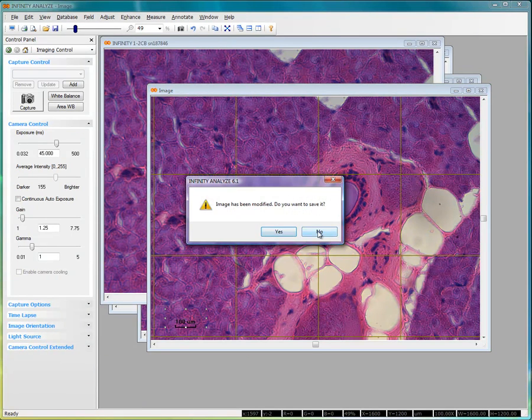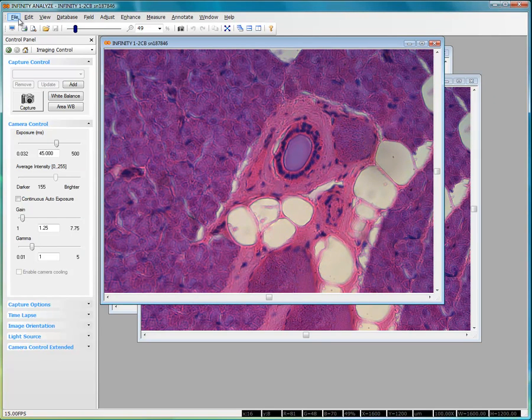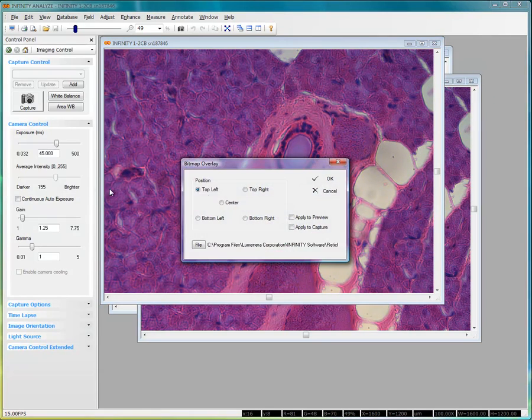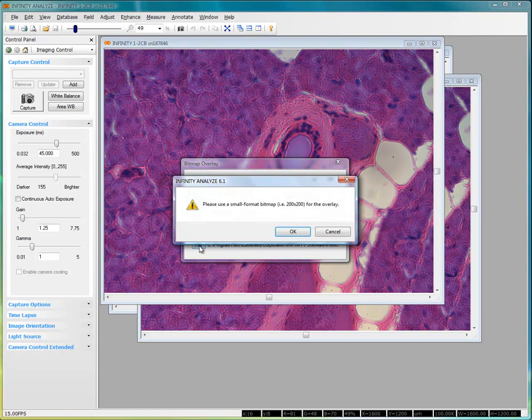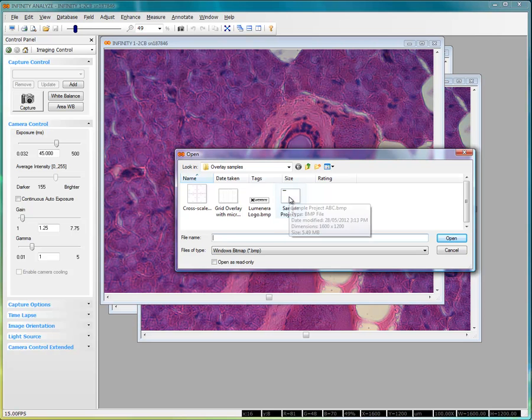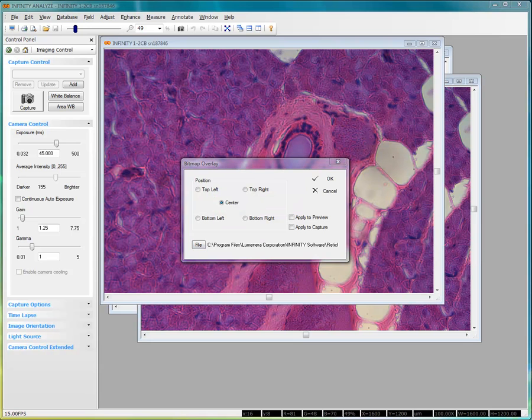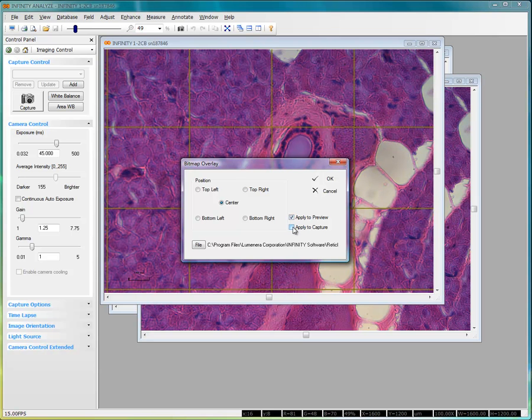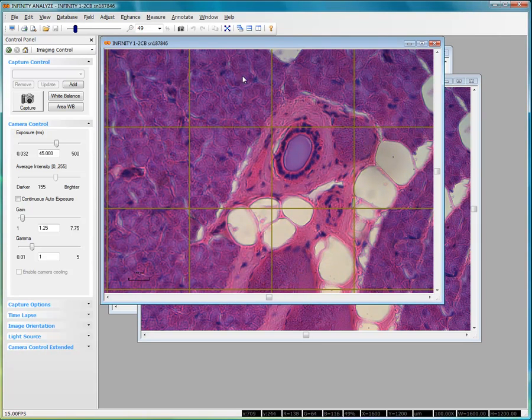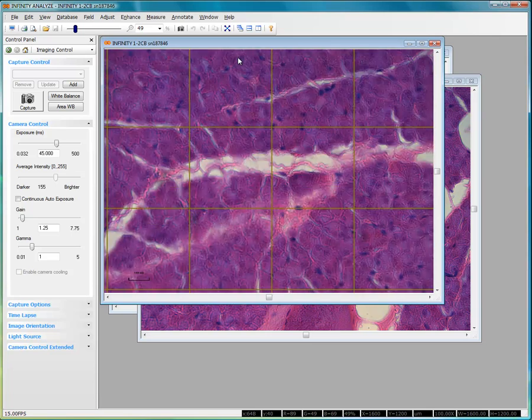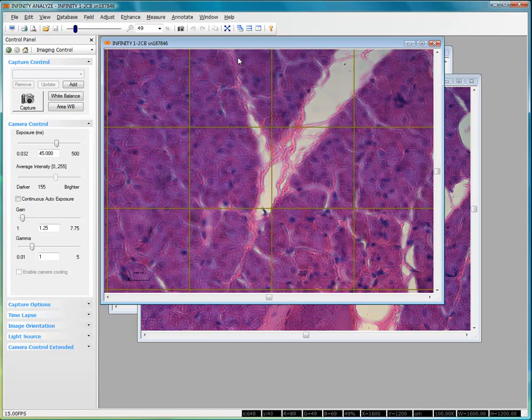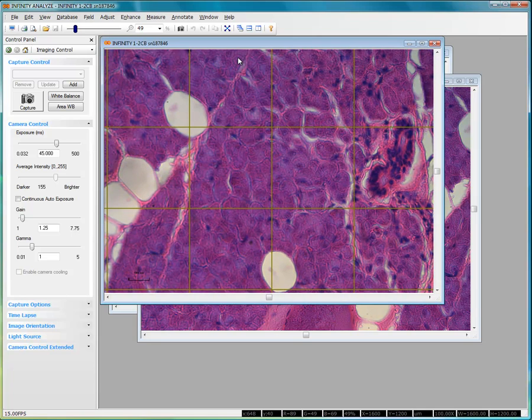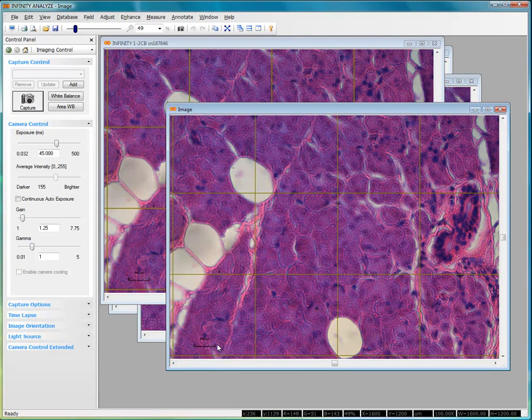And now, if I want to go back to my panel, and select my Bitmap Overlay, choose my new file that I've saved here, Grid Overlay with Micrometer Bitmap, and click on Open. Wait a few seconds for the load to complete, and then click Apply to Preview, and if desired, Apply to Capture, click OK, and now that's in my live preview image. I can move my image underneath. Any sample that I want, I can place underneath here. Click on the Capture button, and because I've said Apply my Bitmap Overlay to my captured images, I'm getting my micron scale and the grid overlay.